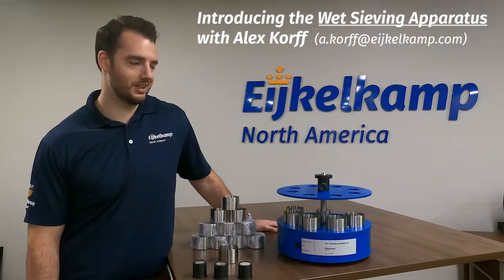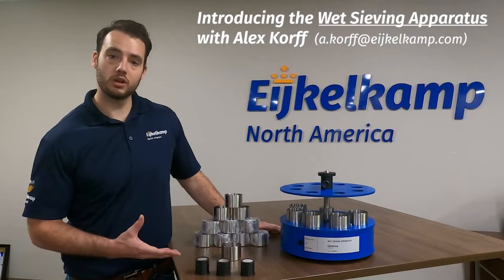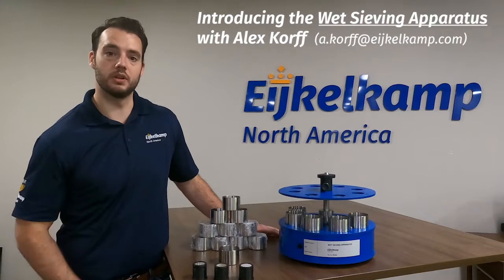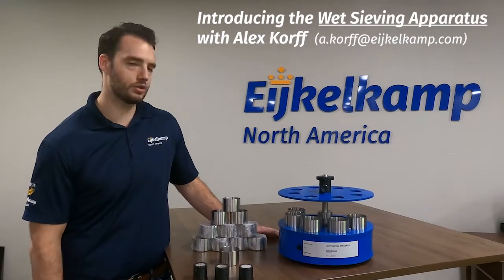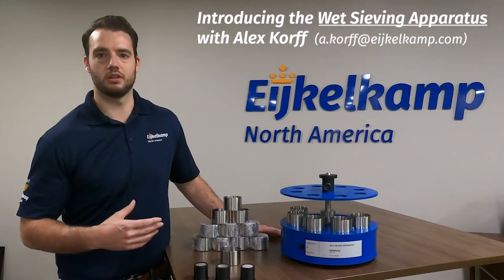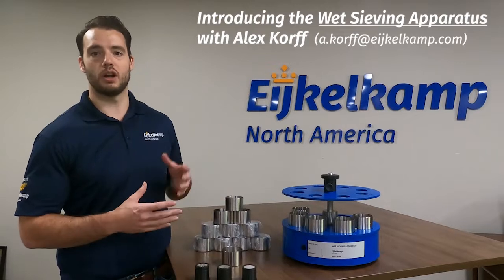Hi, this is Alex with Eijkelkamp North America and today we're going to talk about our wet sieve apparatus. This is part of our laboratory equipment section where we're really looking at soil stability — whether you're in agriculture or soil conservation, understanding how your soil is going to interact through wind erosion, water erosion, or how it's going to do with crops is very important.